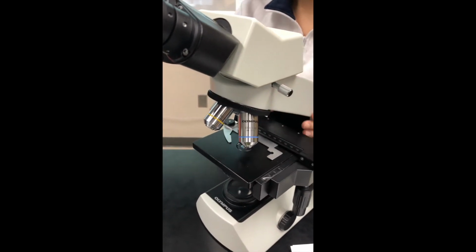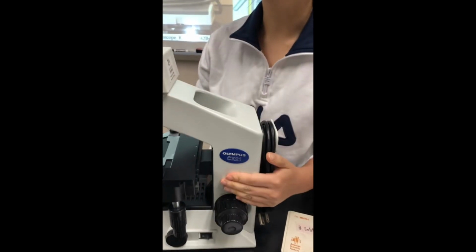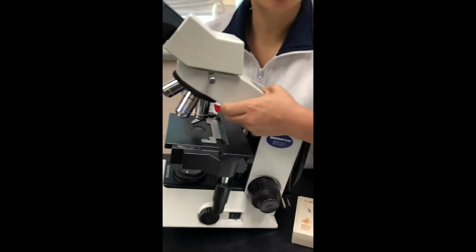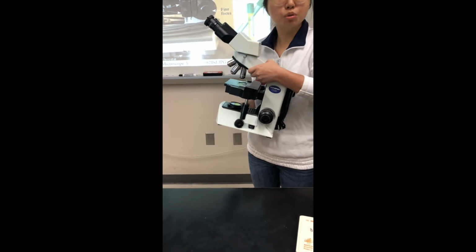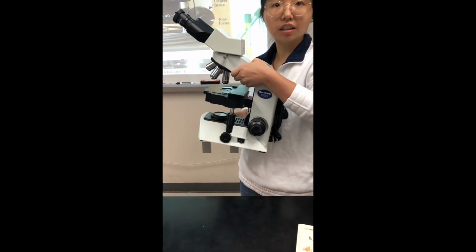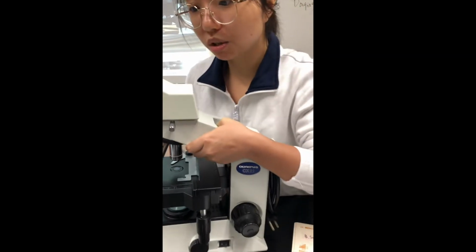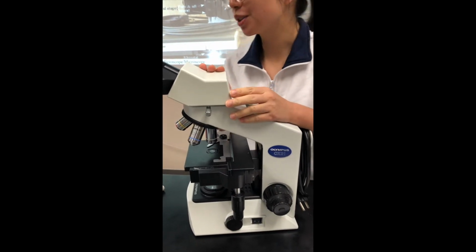Then let's have a look here. This is our arm. Talking about the arm of our microscope, I want to emphasize that every time you hold your microscope, you need to use your 2 hands. One hand you attach to the arm, another hand you support the base. So you use 2 hands to carry our expensive microscope.